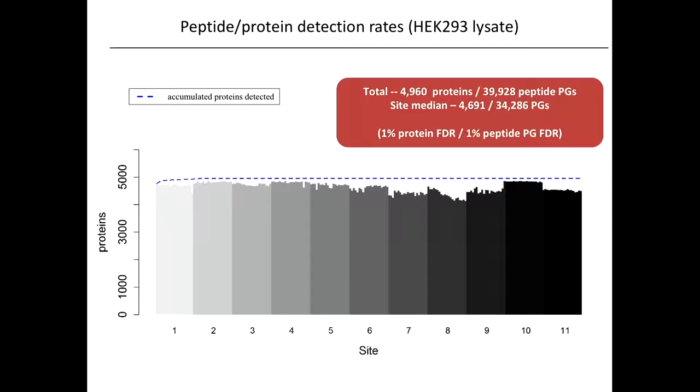But overall, they performed actually quite remarkably similarly, and this simply says that they identified a similar number of proteins by their acquisition. This does not say anything about reproducibility. But this blue curve says something about reproducibility because it is an accumulation curve and basically says that up to here that many proteins are identified. And then when you go with all the runs up to here, then that number of proteins would be identified. So the curve you appreciate is that this curve is essentially flat.